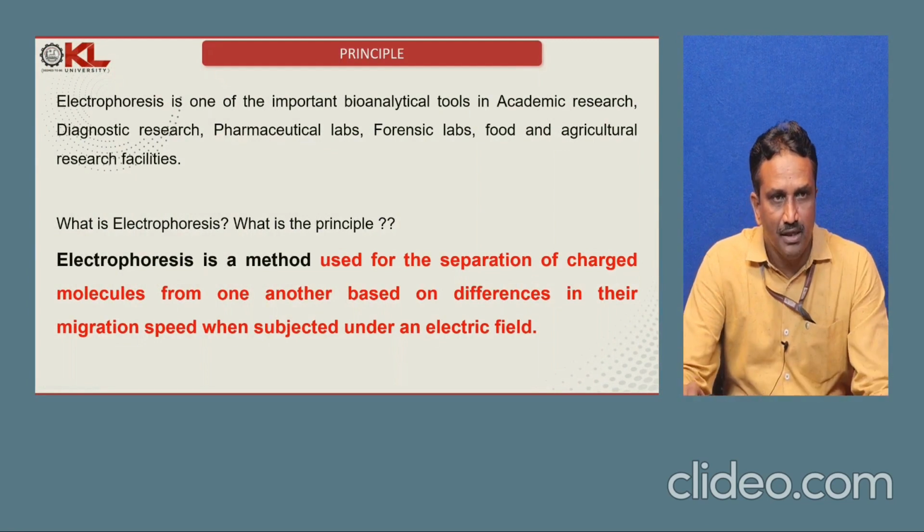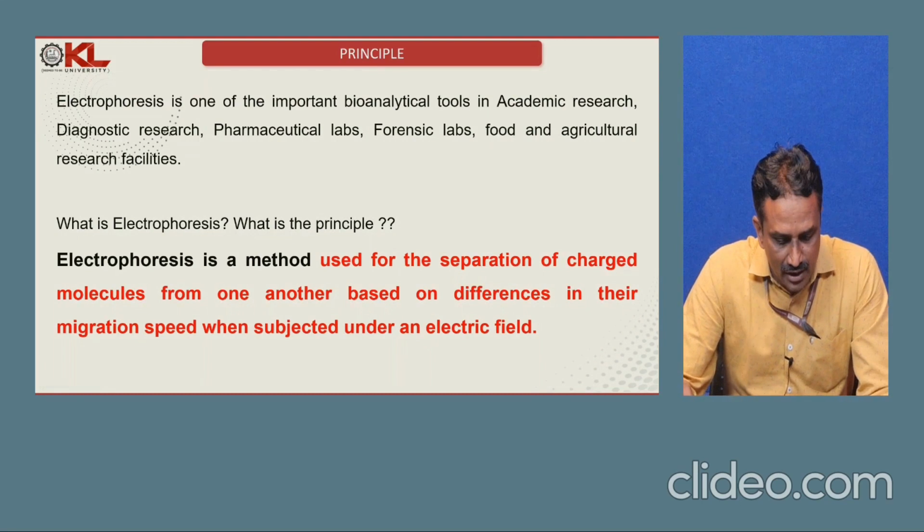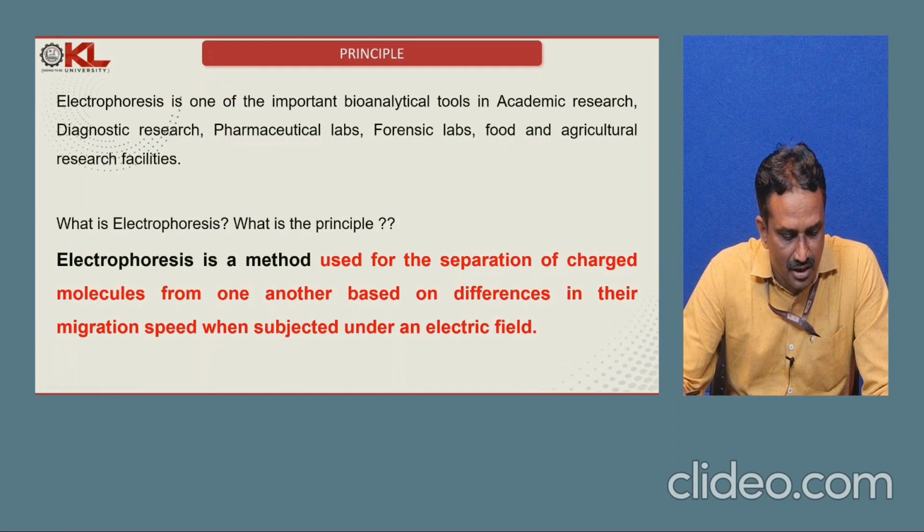Coming to the principle, electrophoresis is one of the important bioanalytical tools in academic research, diagnostic research, pharmaceutical labs, forensics labs, food and agricultural research facilities. It has a wide scope of application. Now let us see what electrophoresis is and what its principle is.